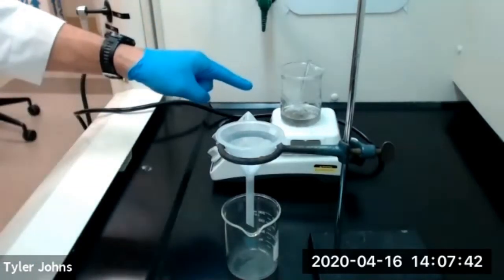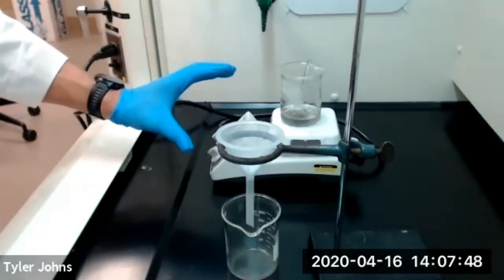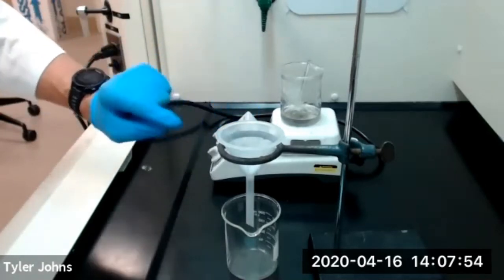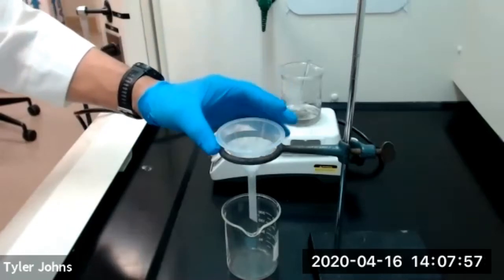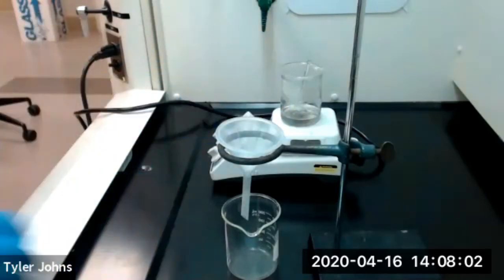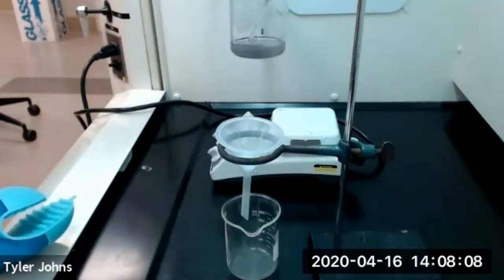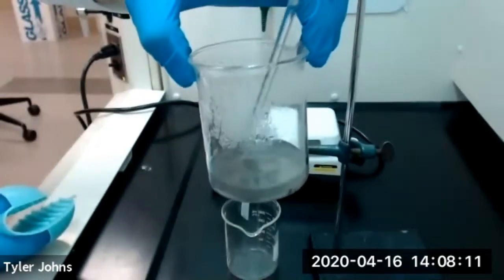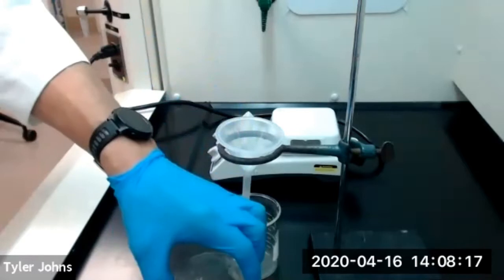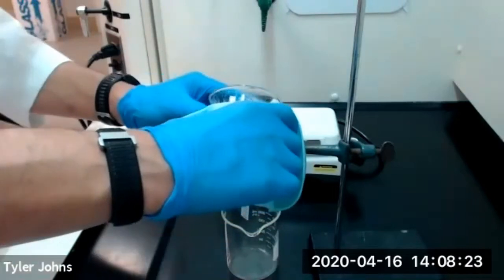At this point we've boiled our aluminum plus potassium hydroxide mixture until we reduced the volume by about 25 percent or so. We're going to take that now off the heat and transfer it into a funnel with some glass wool inside of it. That glass wool is going to catch any impurities that are in our aluminum potassium hydroxide mixture, which you can see there are some impurities inside there. We're going to remove the glass stirrer rod and use hot hands to transfer the solution into the funnel.